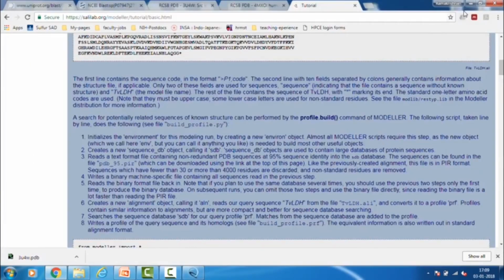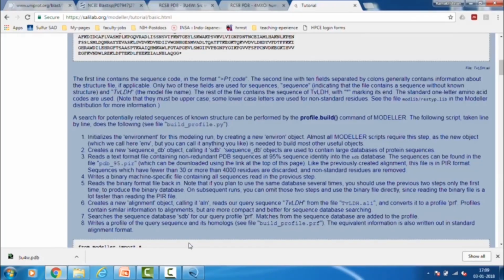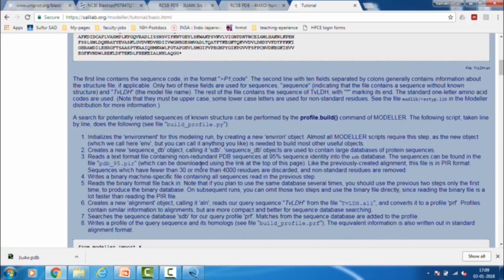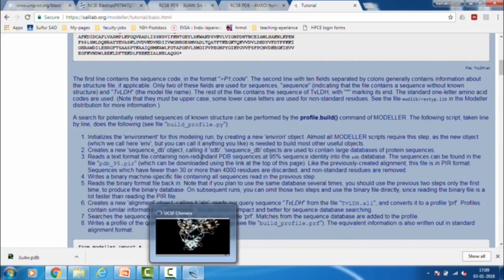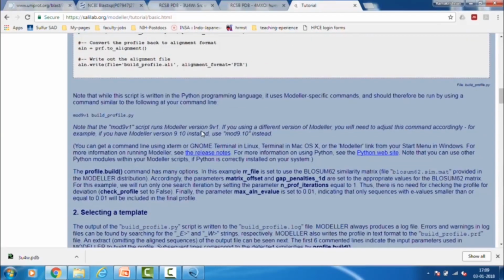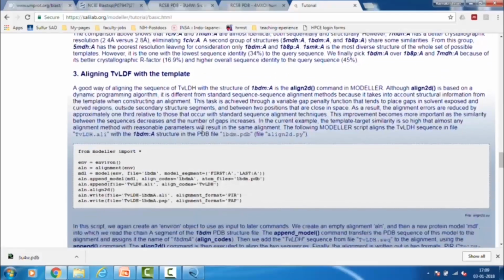So, in model building there are 2 essential steps which are very important to discuss here. First is the alignment of the protein sequence with the template structure. We will call it target template alignment. To do this, we can get the Modeller script from their website here.